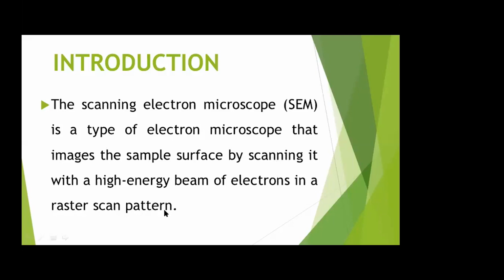A raster scan or raster scanning is the rectangular pattern of image capture and reconstruction of it in a monitor. In raster scanning, the beam of electrons sweeps horizontally left to right at a steady rate, then blanks and rapidly moves back to the front, moving towards the left, where it turns back on and sweeps out the next line.